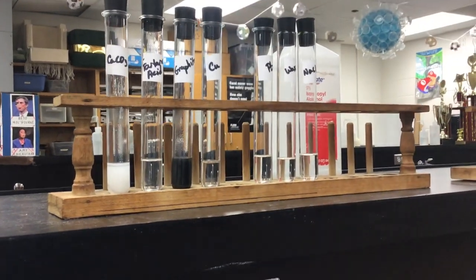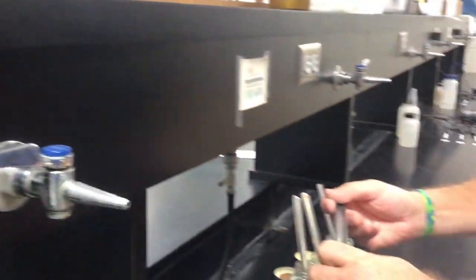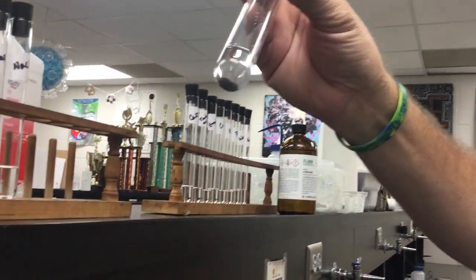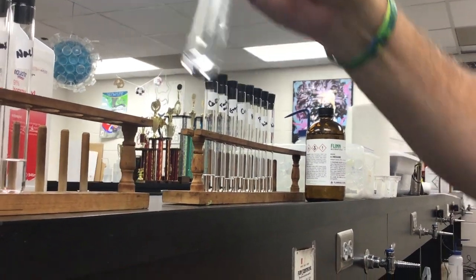And then aluminum. Take a little bit of aluminum on the scoop. Drop some aluminum in the isopropyl. Shake that up a little bit. You can see what you see in the bottom there. And write down your observations whether you think these things are soluble or not.